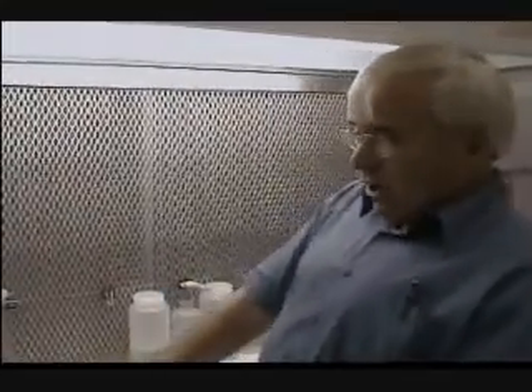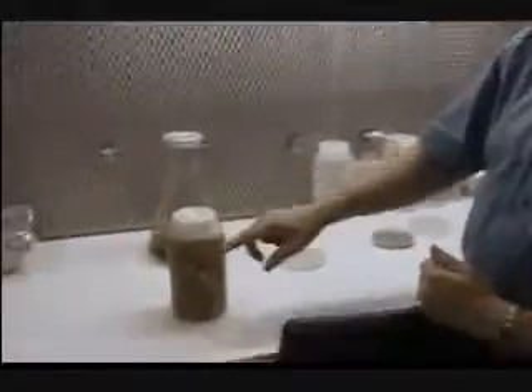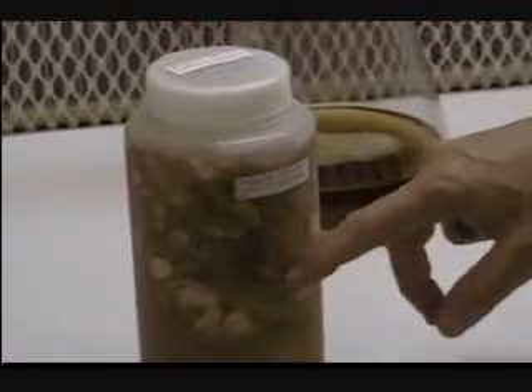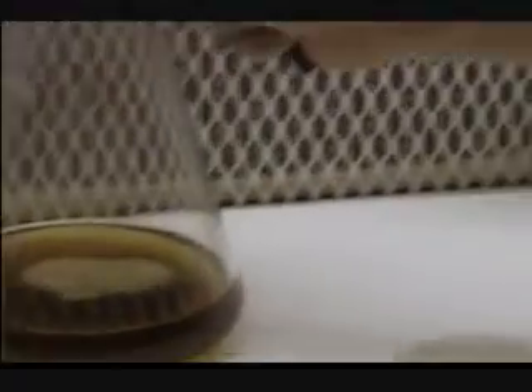Once they're fully colonized in the beakers, we filter it off — we don't want them growing anymore, so we put them in the fridge. We filter off the nutrient media and concentrate it. This is the end product, basically the last stage before we apply it in the nursery. What this is, is just hyphal mats packed together in concentrate form. It's like a can of mushrooms — it's in the mycelium state. As a fruiting body they would form a fungus, but here it's just mats condensed together.